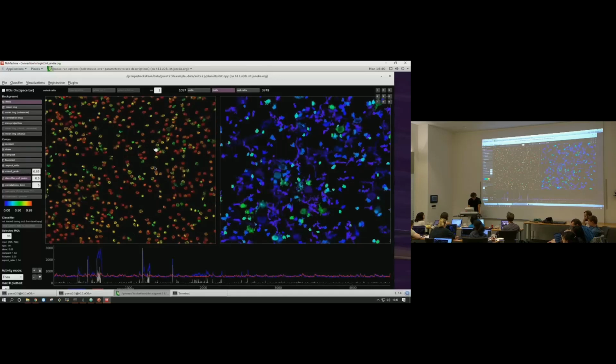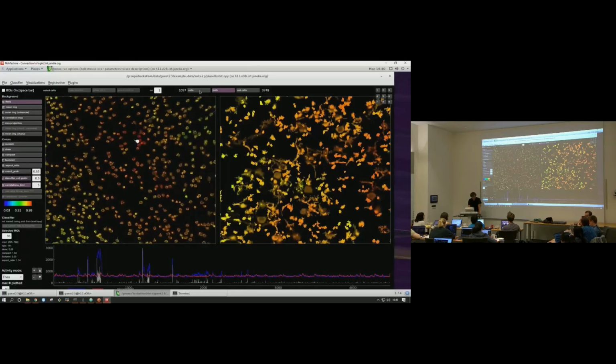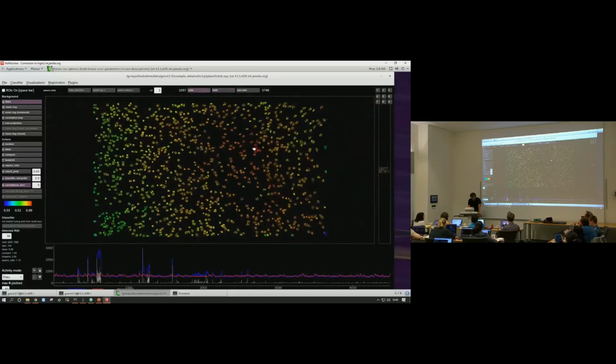Okay, classifier. We already looked at that. Now this is where Suite2P starts to become more like an analysis tool. Of course, it's not meant to replace the real analyses you should do outside of the GUI. But it's meant to start giving you a first sense of what the data is doing. It might help you design the next experiment for the next day, but it's not going to go in a figure in your paper.